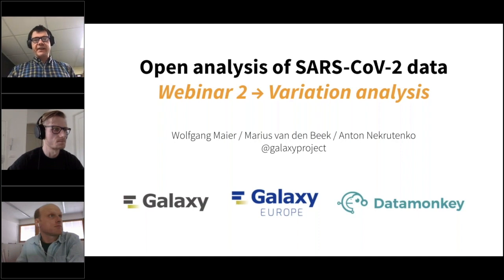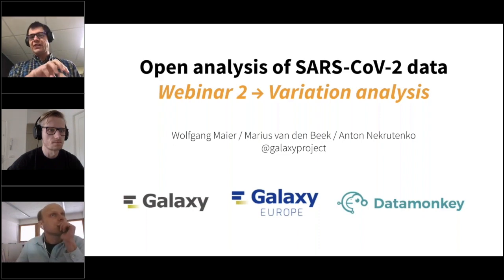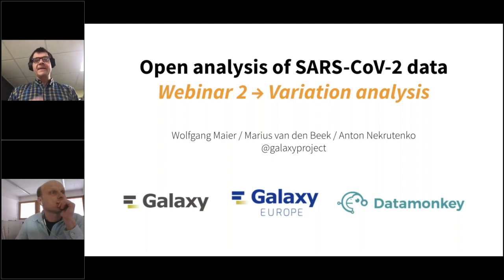So today's subject is variant analysis, and by variant analysis, we mean what happens within a sample, within an individual. We are not talking about differences between different genome assemblies of SARS-CoV-2. We're talking about next generation sequencing data from a single individual and trying to assess how much variation we have within that individual. It's interesting for a number of reasons.